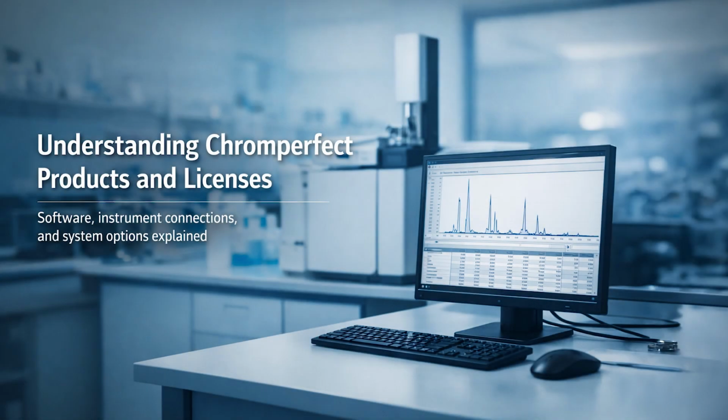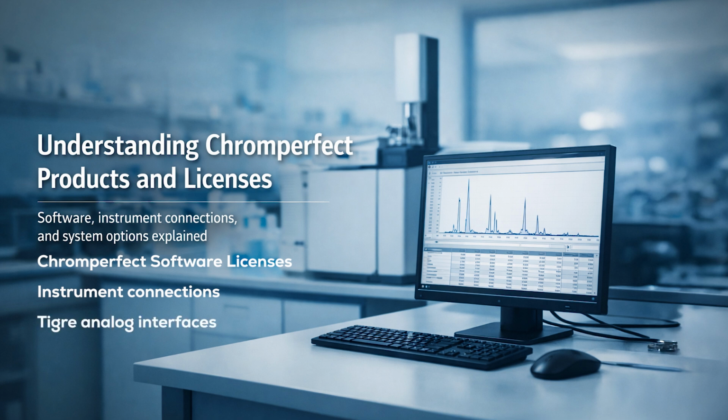Understanding Chromperfect products and licenses. Hello, and welcome. In this video, I'll explain how Chromperfect products and licenses work. As this is often an area of confusion for new customers, I will clarify the following common topics: Chromperfect software licenses, instrument connections for digital and analog instruments, Tigre analog interfaces, data analysis licenses, application software add-ons. I'll explain everything step by step and keep the language simple.